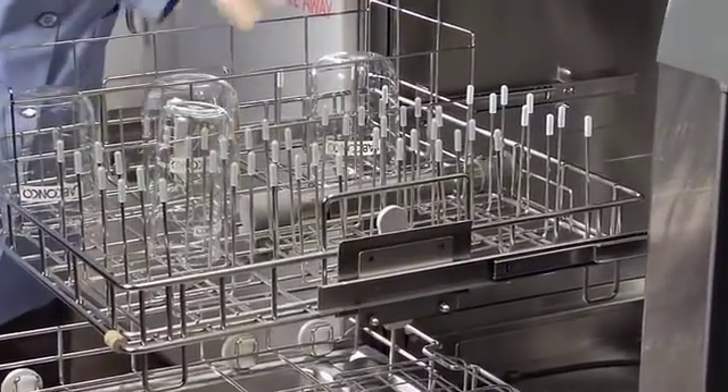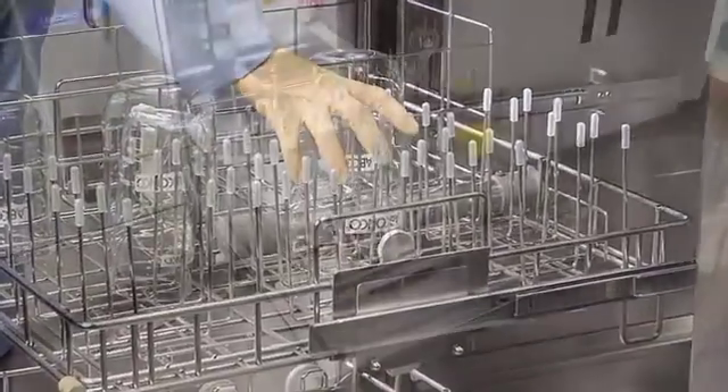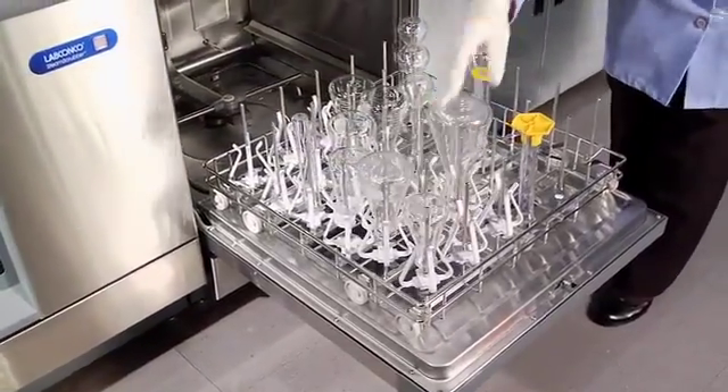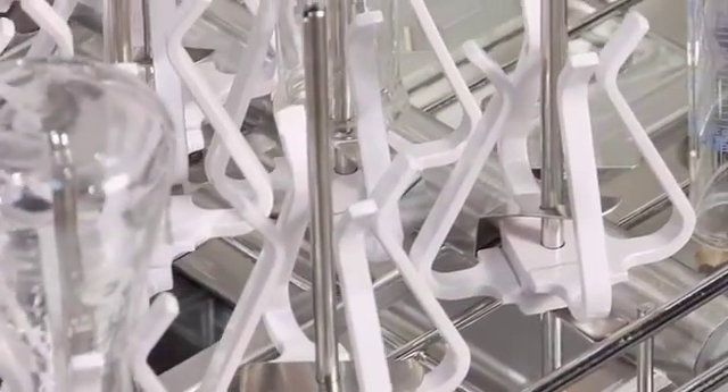The Flask Scrubber laboratory glassware washer has a lower spindle rack that thoroughly washes and dries up to 36 pieces of narrow neck glassware.